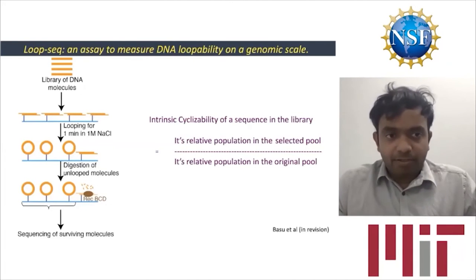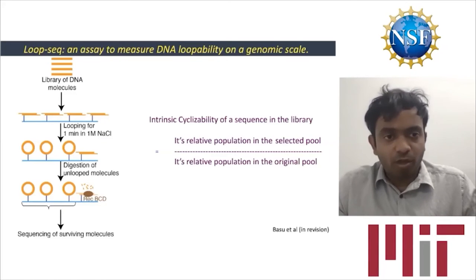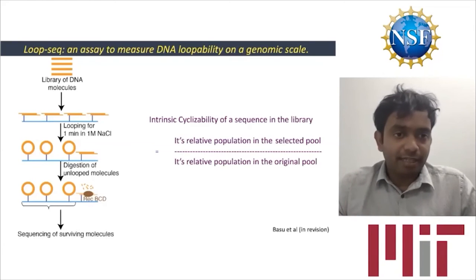To do that, we developed this technique called LoopSeq, where we start with not just one sequence of DNA, but a library containing as many as 90,000 different sequences of DNA molecules and multiple copies of each sequence.